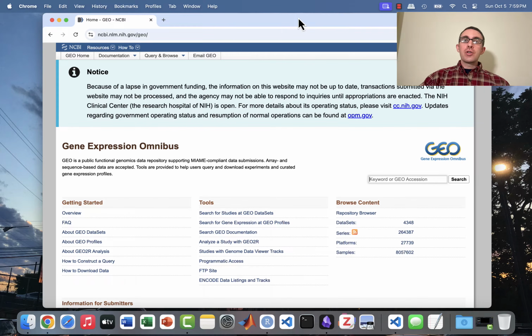So in this lesson, I'm going to show you guys how to download the dataset that we're going to be using for our first project. So yeah, we're almost at the point of actually writing the code to do this analysis. But first I'll show you guys how to download this dataset. And like I've been saying, this actually is a real dataset.